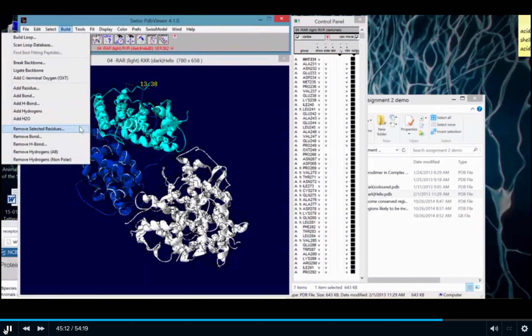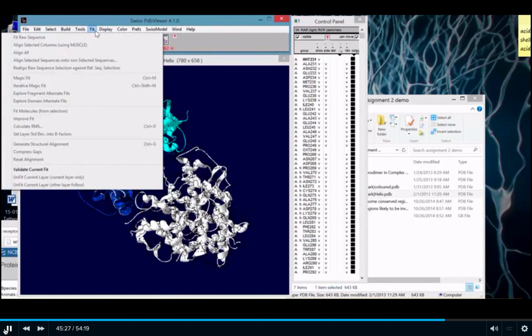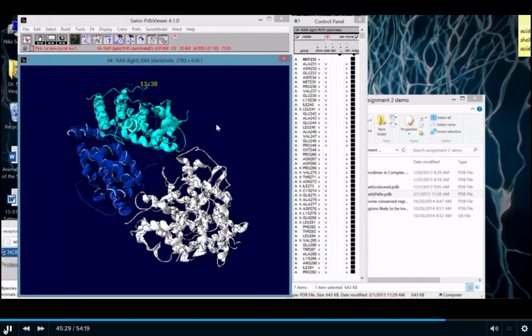At the end of the day, you're making a mutation. You're looking to see how that changes the structure, and then you're going to hypothesize that change. You'll then back it up with some hard data, either numbers or display of bonds, display of surface charge, display of topology, energy of folding, things like that. And that's your proof that your hypothesis would be correct.